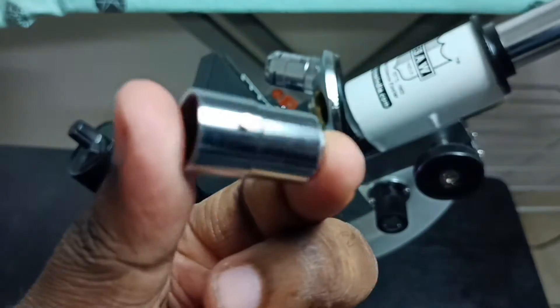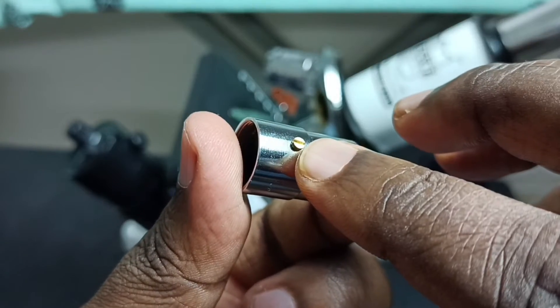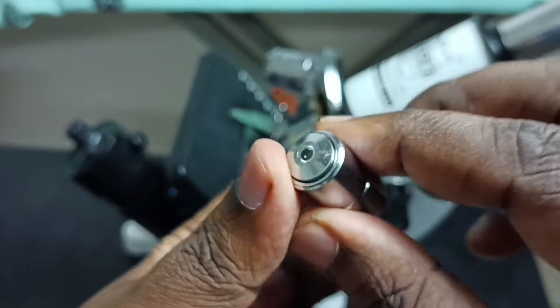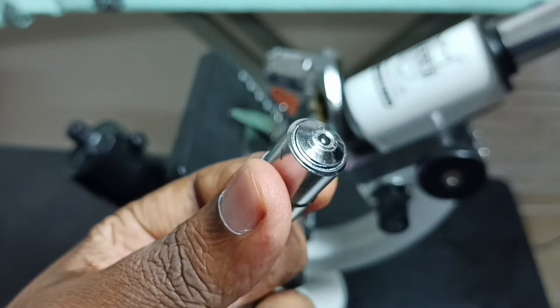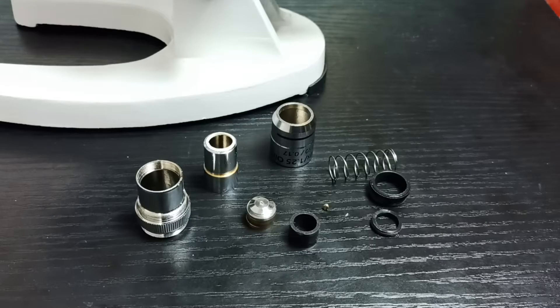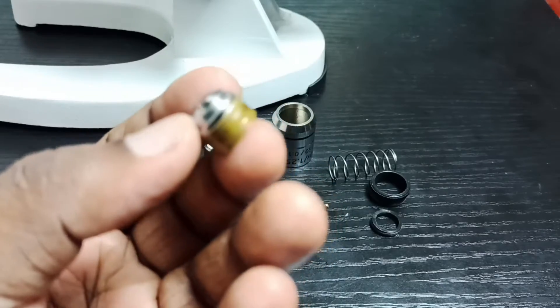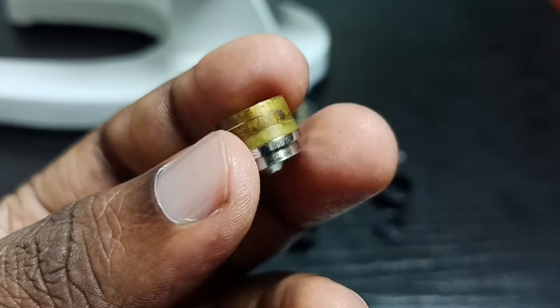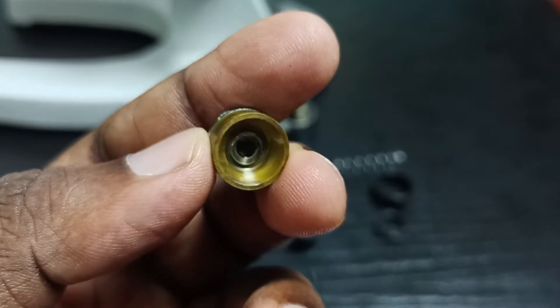We can also remove the screw, and remove this plastic. Then we can take this lens outside — I will show you how to take it. See, here I have taken that lens outside. This is the lens of the objective lens of the microscope, so we can clean it.